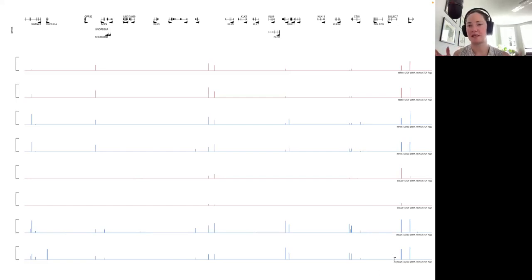And these are those persistent sites that Corey et al. were talking about. These seem to be really important for structure, versus these CTCF sites and peaks here in the middle, which don't seem to be as important. They are the first that are washed away when we do that silencing step.